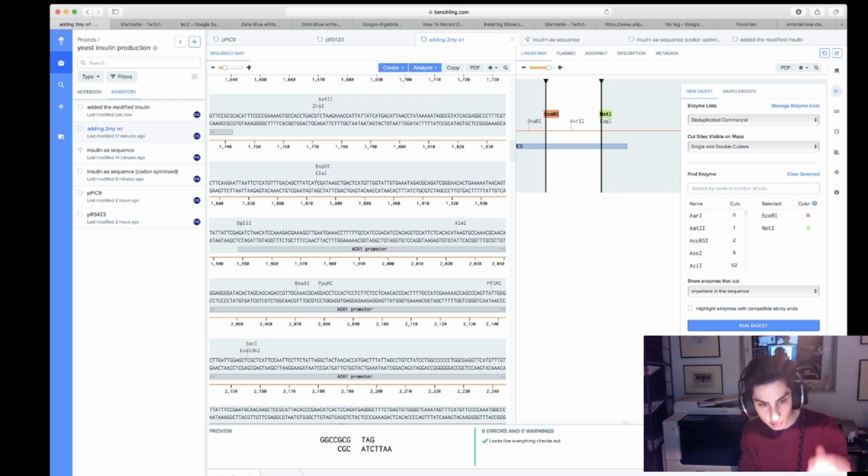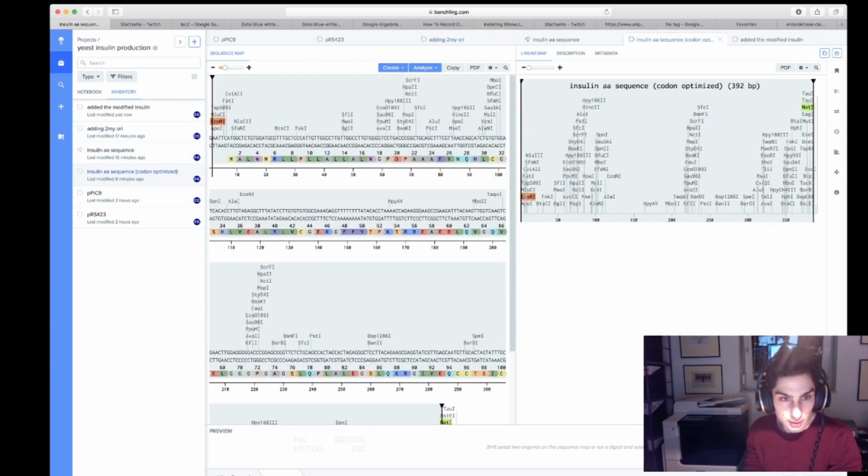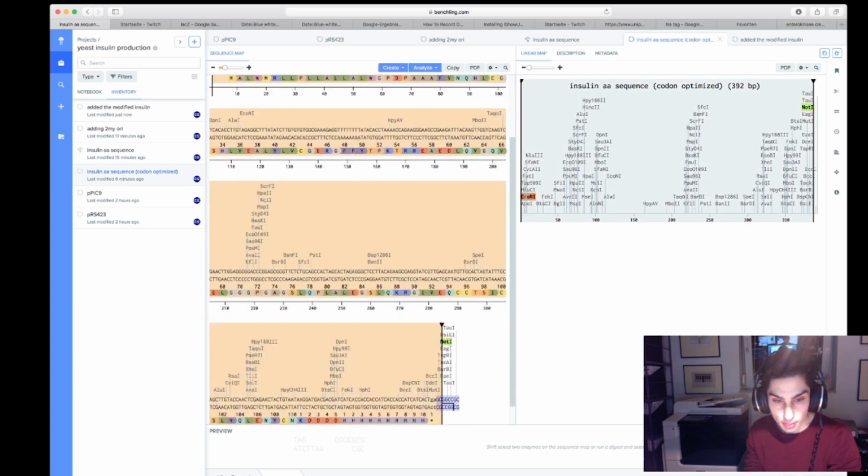So now it's properly in the invert selection. Set from selection. And now it also has 0 errors and 0 warnings, so I think that looks right.